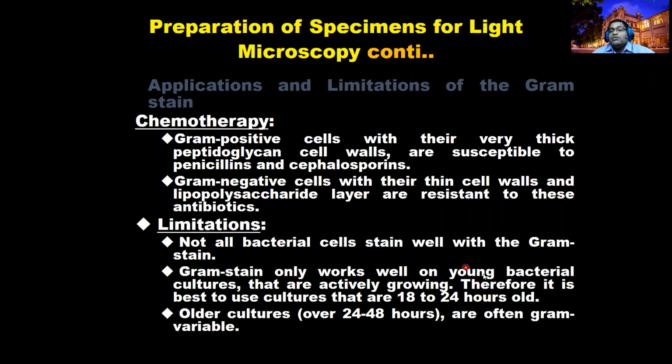The gram stain only works in young bacterial cells, within 18 to 24 hours. More than 48 hours, it won't work, because the peptidoglycan in an old culture matures and the dyes will not work. Therefore, only young colonies can work.